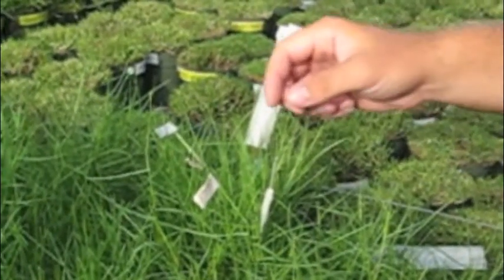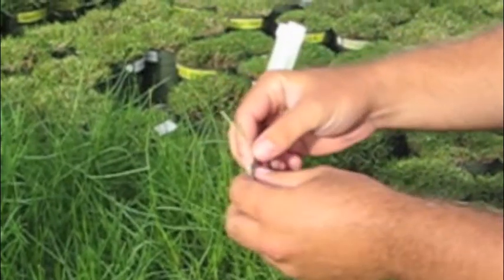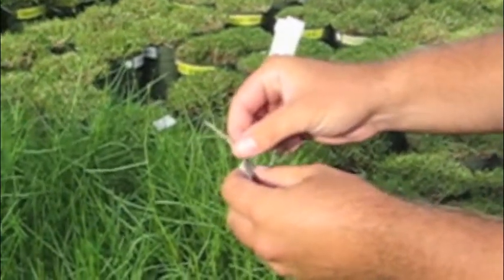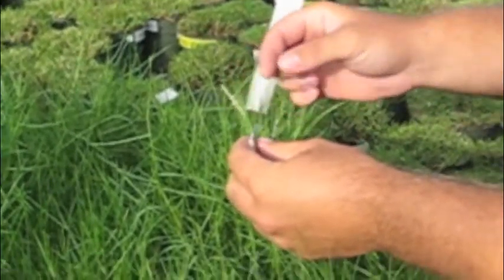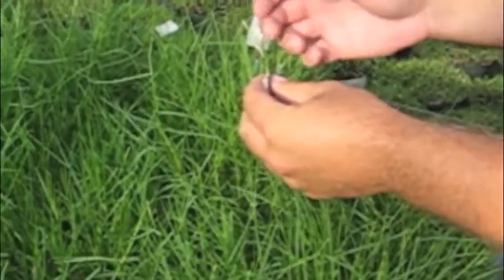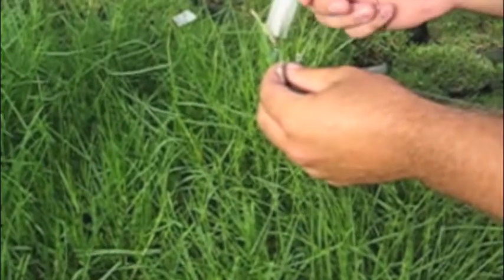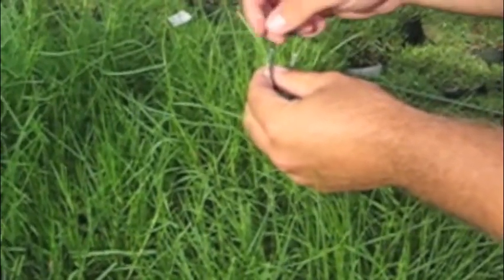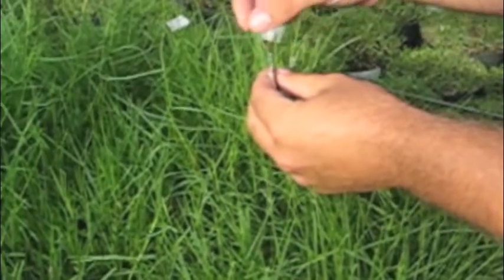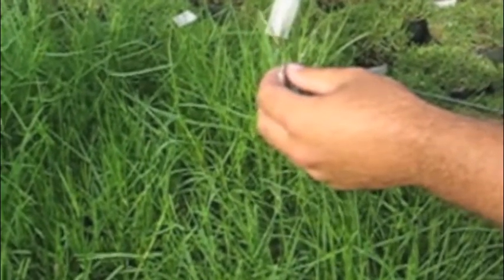On the female parent we're going to use in the cross, you can kind of see these white anthers here. We don't really need these for the cross, and since a seashore paspalum is self-incompatible, there's really no need to emasculate the plant. We can simply run our fingers along here — you can see the white anthers have been removed and all that's left is these purple stigmas.